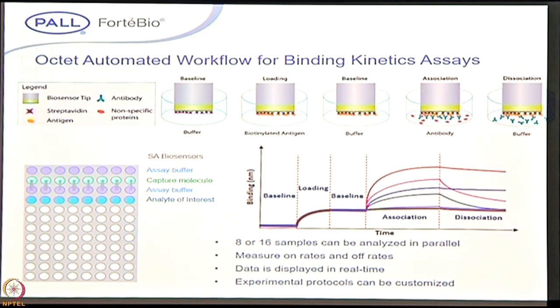When the same sensor moves to the next well containing a capture molecule, one of the proteins of interest you have to immobilize on the sensor surface, then the sensor dips into that well, and you can see the loading response. As I mentioned, some molecules go to the sensor surface, and you can see the change, right? The phase shift. So you can see the loading response.